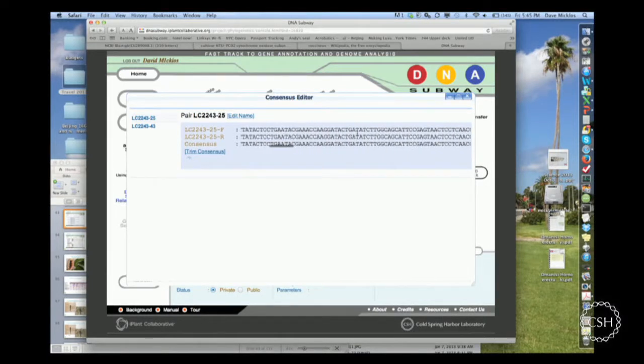And as you come into the good quality sequence, you'll see that the forward and the reverse read entirely confirm one another. And this is the sign of very high quality sequence. You can really go to the bank with this. And at the end, you'll see that the forward read is providing some extra information. You may or may not want to use this information. Frankly, you usually trim it off.